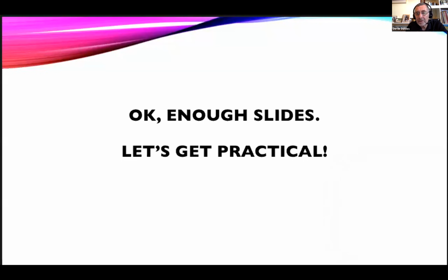It's taking either a target value or values that we've defined and altering the voltage to make that peak appear in the same place, which is then something that we can monitor over time. And if the changes we have to make are outside a defined range that we can define, it's going to pass or fail.